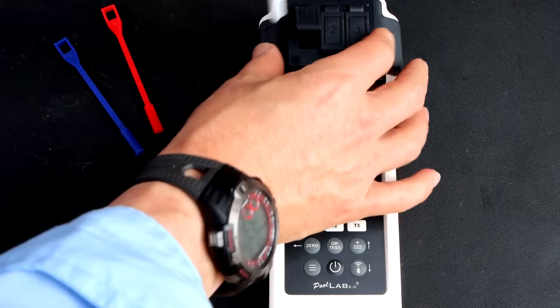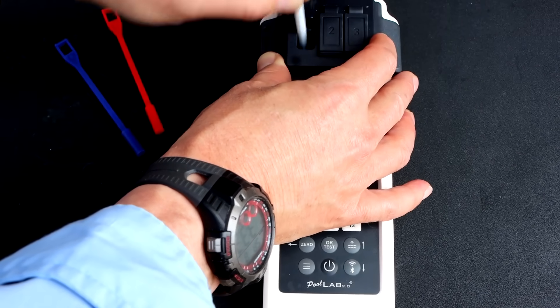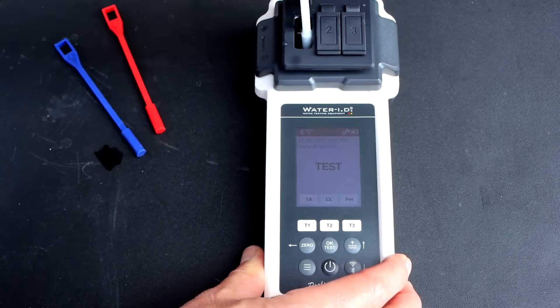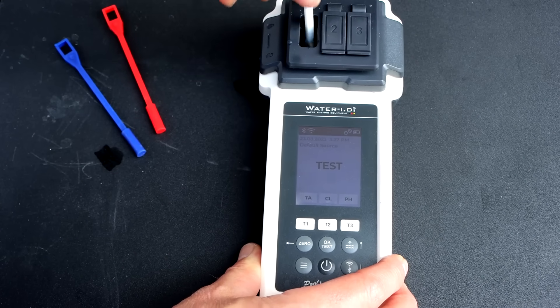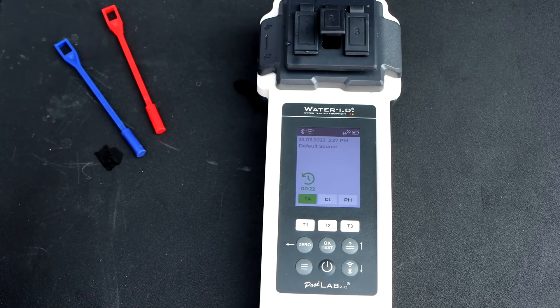There are three stirrers or crushers, all different colors, so that you can do all three test factors without cross contamination. You can see a different color stirrer being used in each chamber. I really like how deep these chambers are — you can really crush the tablet rapidly without worrying too much about water splashing, especially with the rubber guard.